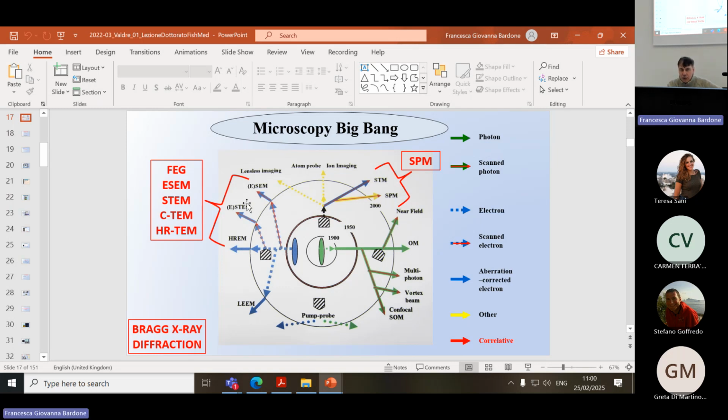Today I will focus mostly on environmental, but there are many other techniques of microscopy with electrons: scanning transmission, conventional transmission, high resolution transmission. We will find a lot of different types of electron microscope techniques if you look around in every lab around the world. And every different type of instrument was built as a function of what you need it for.